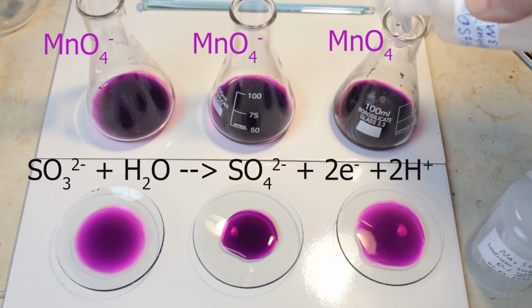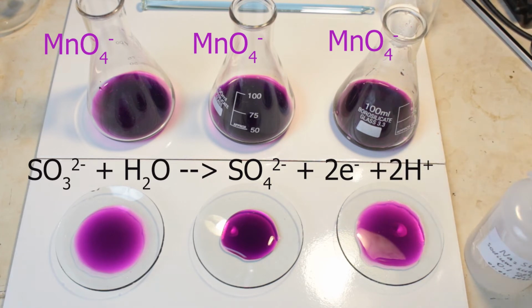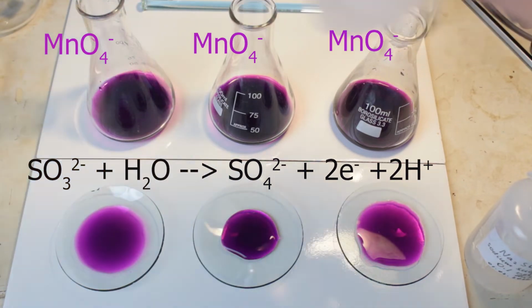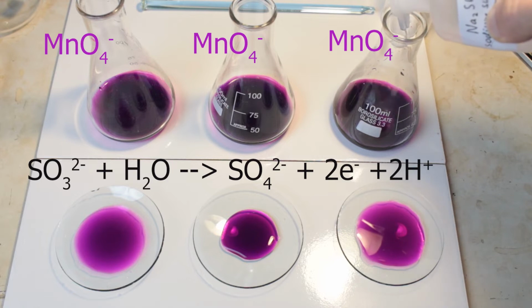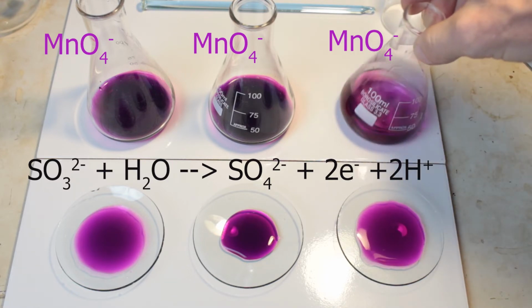So here you see I've forgotten to acidify the flask, and now I'm putting sulfuric acid on the right and sodium hydroxide on the left. And now it's a time to add the reducing agent. Sodium sulfite here is supposed to reduce manganate 7 into manganese 2+ ions.